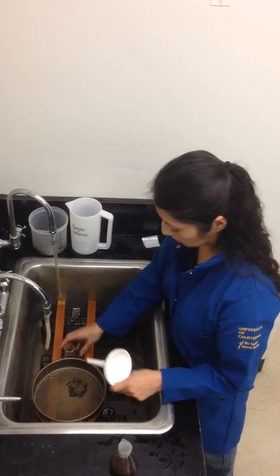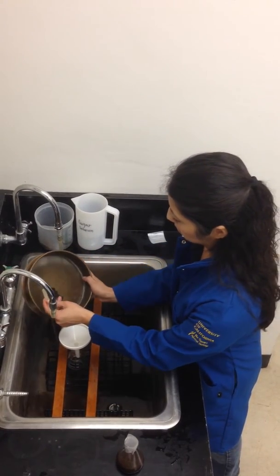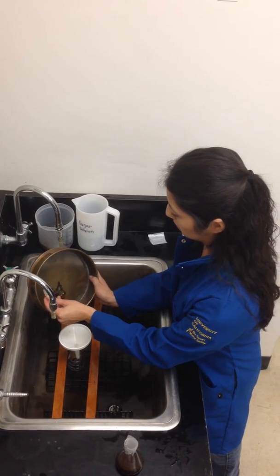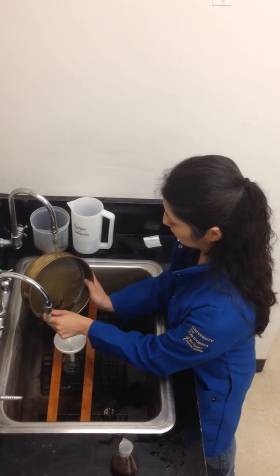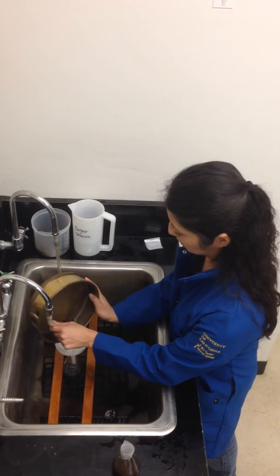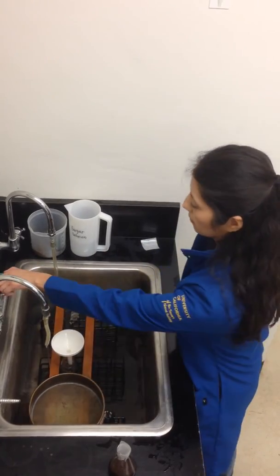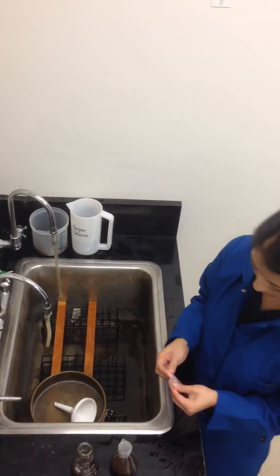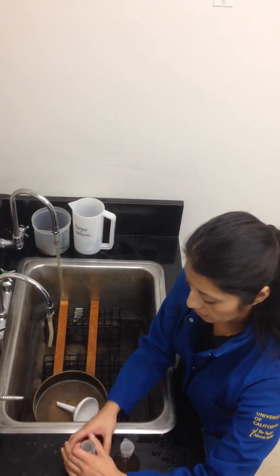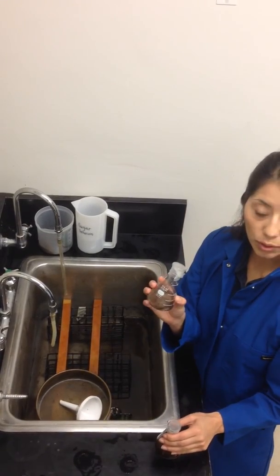Now we will collect the particles into this flask and cover it. So now you have two flasks: one containing water and one containing the sugar solution. And we store our flasks in the refrigerator. Thank you.